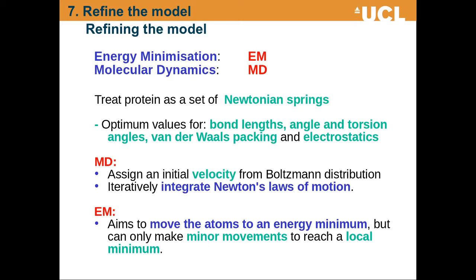Now, the reason that we need to do all these things is because when we've spliced together bits of structure, structurally variable regions from one place, structurally conserved regions from another, then the joins between these may have non-optimum bond lengths and bond angles, there might be clashes, and similarly when we do the sidechain replacements, although even if we're using something like SCWRL to optimize those, there may still be some minor clashes. So energy minimization would allow us simply to move things to a more favoured position.